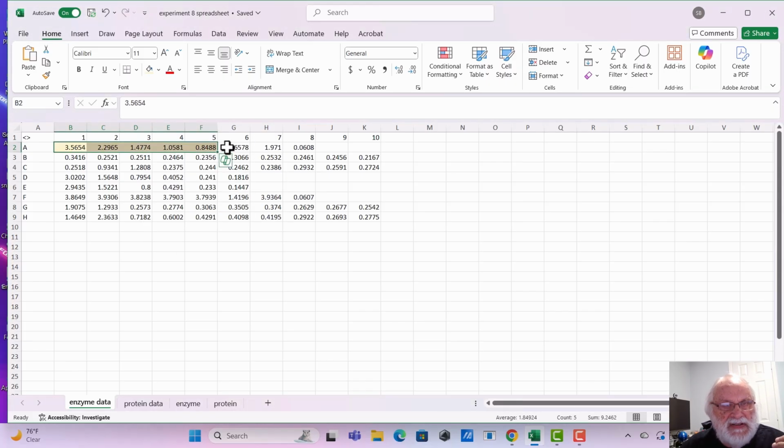Then what we did was we took the remaining part of that extract, all of that 200 microliters, and we added that to the column, and then we added some buffer to that to load the column. And in this case, looking at this data set, the only 2 fractions of the load that were valid were these 2. So let's make that a slightly darker yellow. Then we collected all of the wash, 0.1, 0.3, and 0.6 molar, and that's all these fractions, and we'll make that a dark yellow.